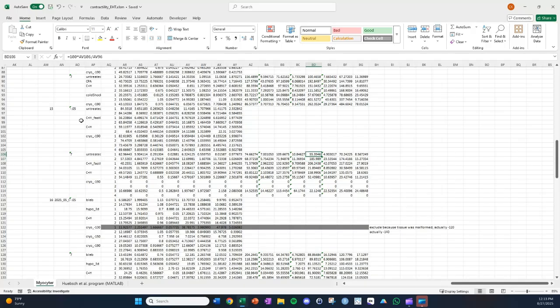Without that, what I just tried to do was go in order. So if I captured this well first in that experiment, I'm going to capture this well first in the next experiment. And since I'm normalizing to that, hopefully the time spent at room temperature is also pretty constant, and that decay is pretty constant, and so you get a reasonable value in that way. But there might be some things you can do, making sure the brightness is the same with each of these videos, the orientation of the well is the same. That might reduce some of this, but there's of course always going to be a decent amount of variability. So overall, just make sure you're getting a lot of replicates in these studies.